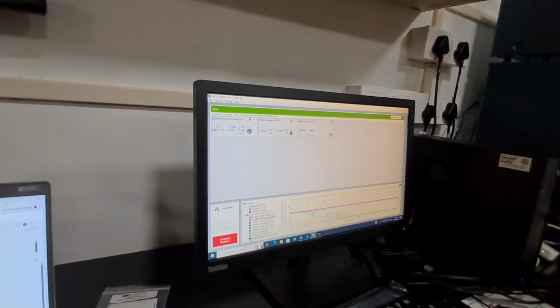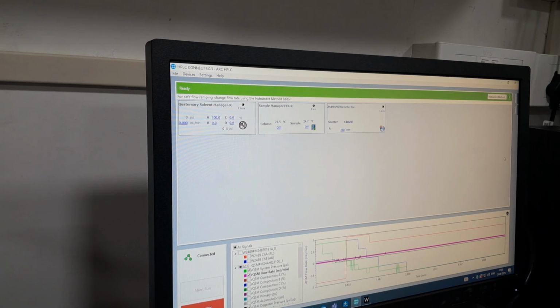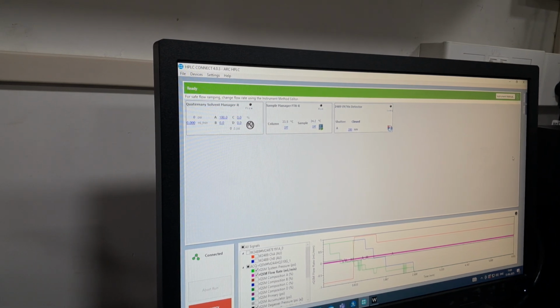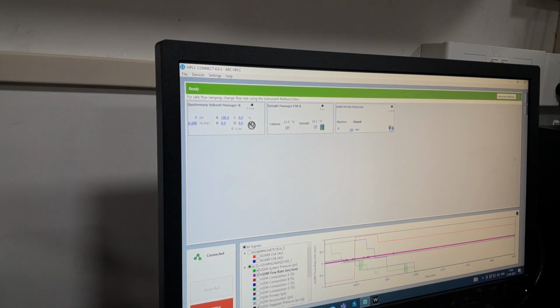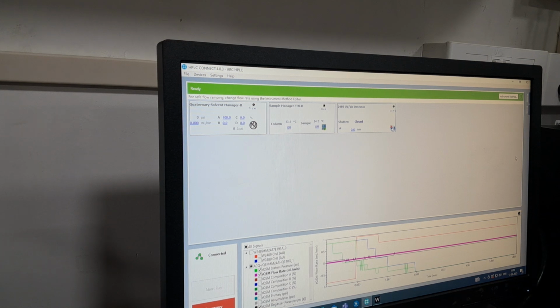I think ethanol is also okay. I saw that there. Yes, ethanol is fine, but procuring HPLC ethanol is a problem. In future we will ask them to bring it. Ethanol is, in this case, the best, but we need HPLC grade as well; ethanol alone is not okay, and it is not easily available.